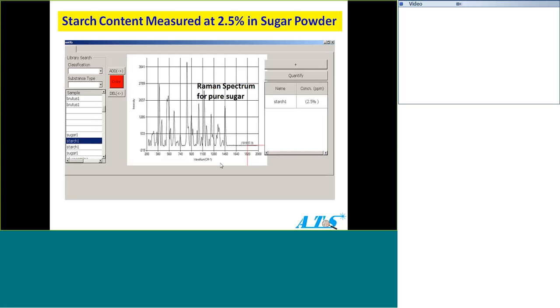No way. But Raman is easy because we have just a spectrum, the pixel. So you can make it identical from instrument to instrument, in Argentina or in Mexico. It's the same, no trouble, no problem at all. Each piece of equipment will produce the same data for you, same structure. That's why the library is useful. Otherwise, it doesn't work.